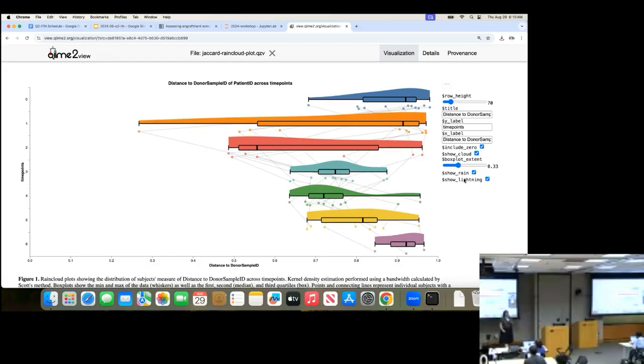And then 5 and 6 is where I was warning you that we're not as consistent with our time points as maybe we'd like to be. So 6 and 5 can be anywhere from like 25 days after the FMT to over 100. And so I suspect that the bounce back we see away from their donor isn't really a lack of stability, but is them emerging that unique microbiome that is caused by their environment, what they're eating, how they're exercising, that kind of stuff.